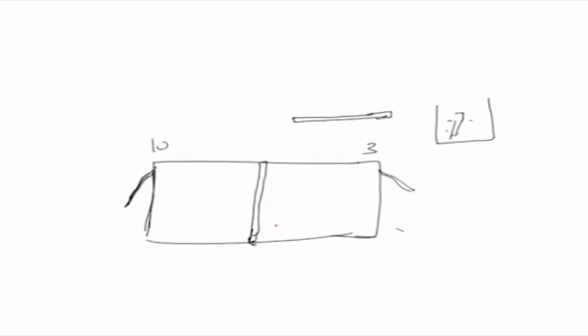There could be other ways. Rather than having this buffer strip, you can put simple obstacles on both sides, and samples in very small amounts. If you want to load more than one sample, there will be slots here.